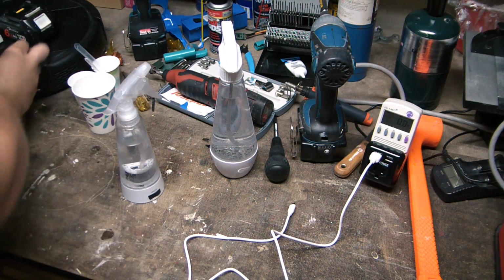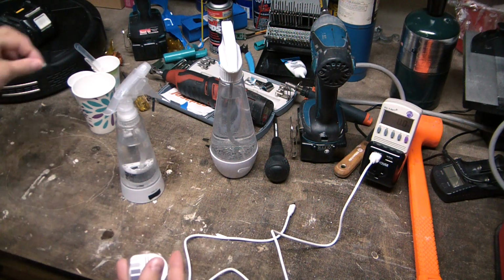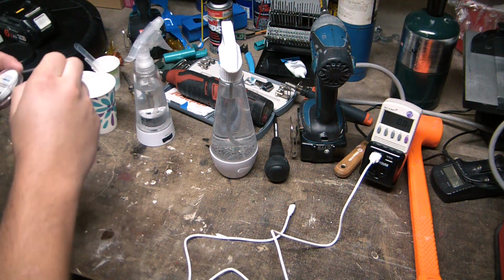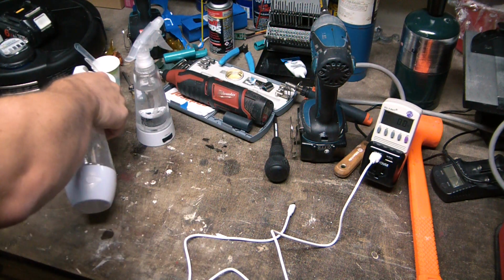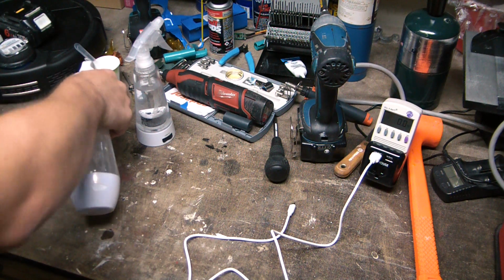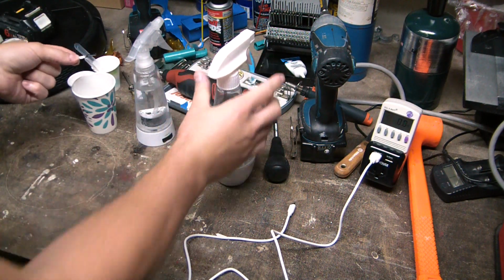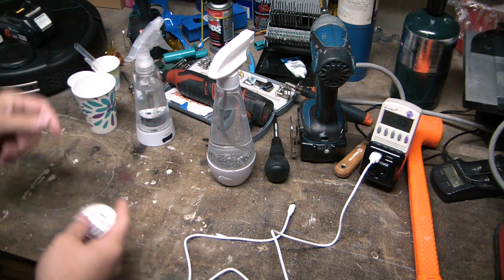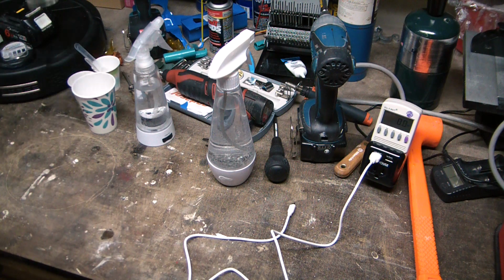Oh! So our limit of reading is 200, and yeah, we're well over that for the small one. Let's see where the big guy stands. Flush this one out. The big one has a much better trigger. Alright, and that one is also at the 200 mark. So clearly we got to do some dilution here to actually see if we can get our numbers.